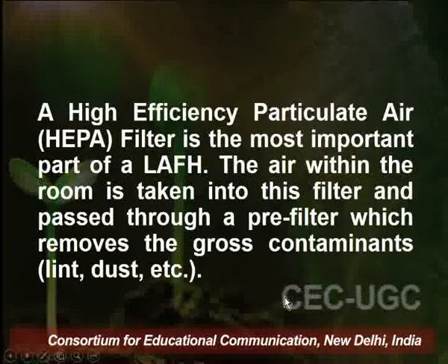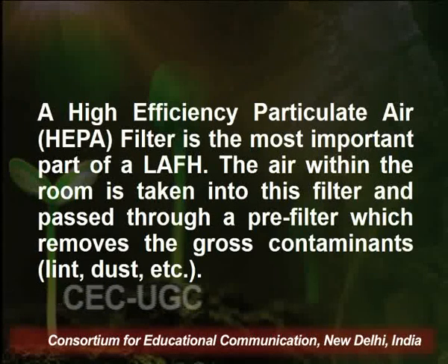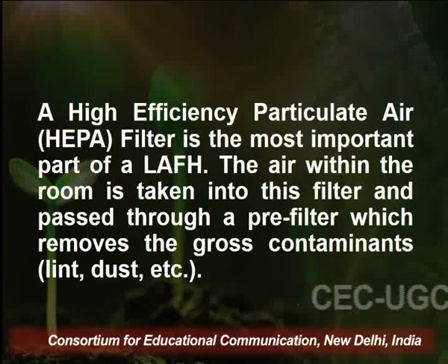So what is a HEPA filter? HEPA stands for High Efficiency Particulate Air Filter, and it is the most important part of any laminar airflow hood.